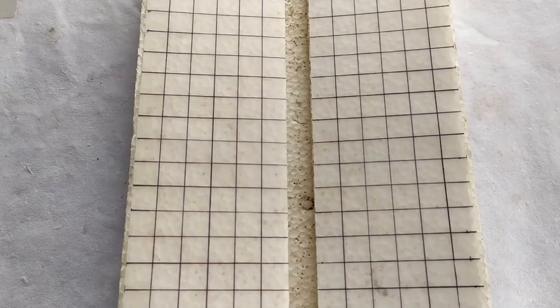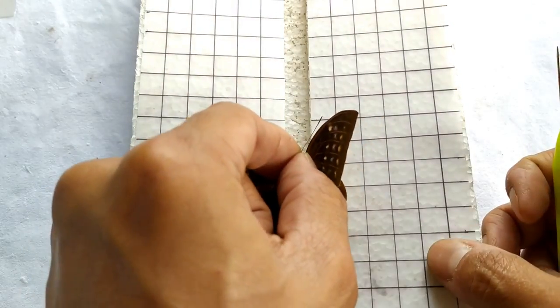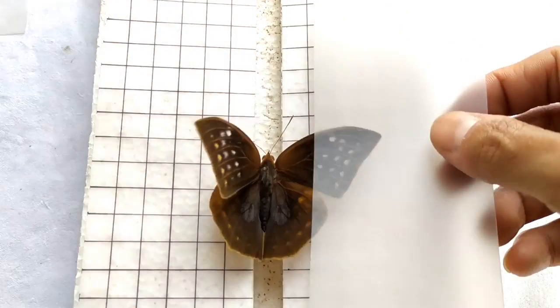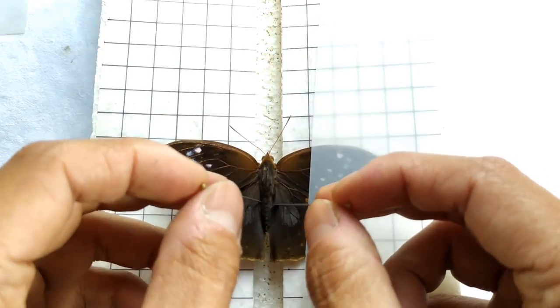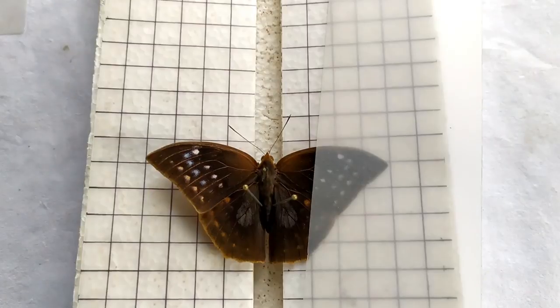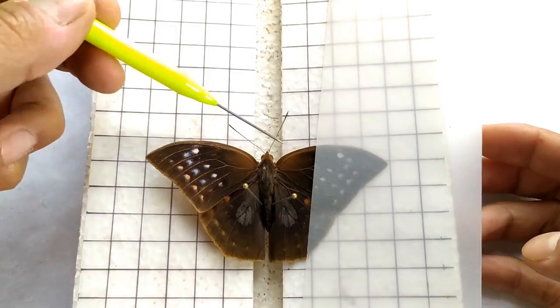Once the pin has been inserted correctly, position the specimen in the central groove of the pinning board such that the body of the specimen lies in the groove. Using two pins, secure the body of the specimen by pinning on both sides of the abdomen, just below where the hind wings originate from the body. The specimen is now ready for spreading.